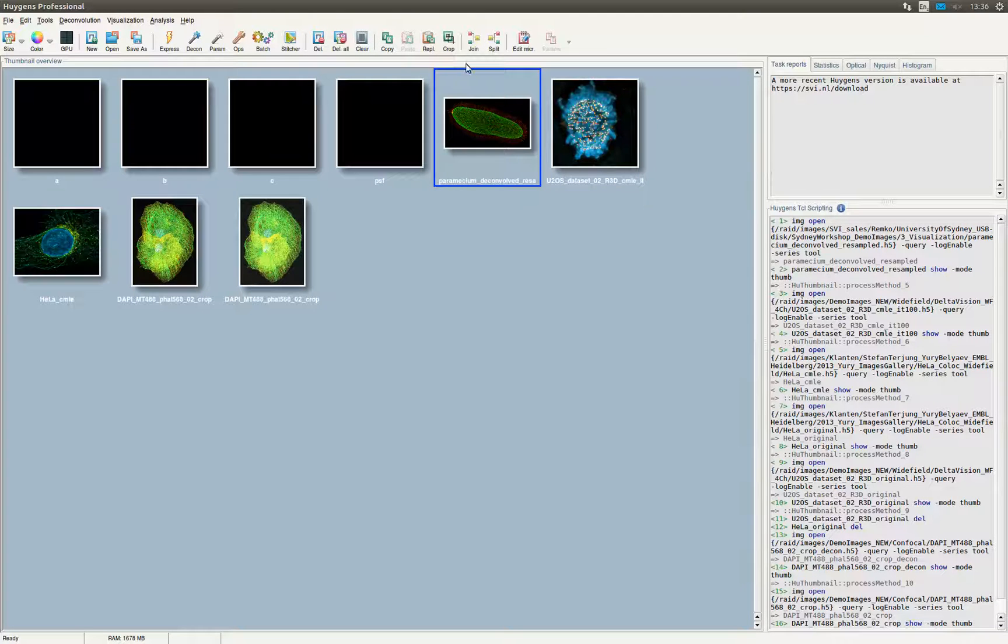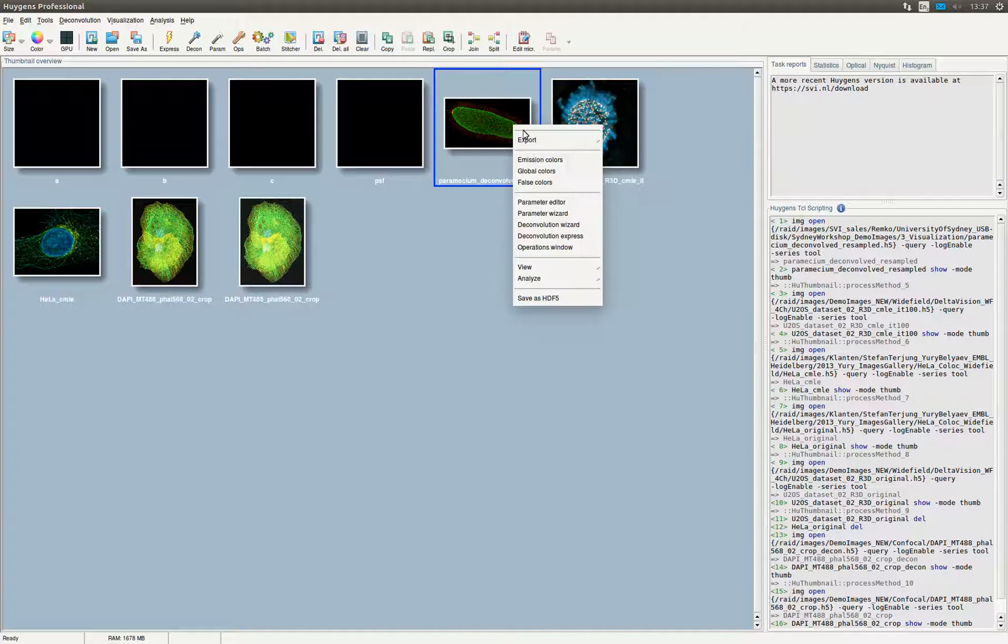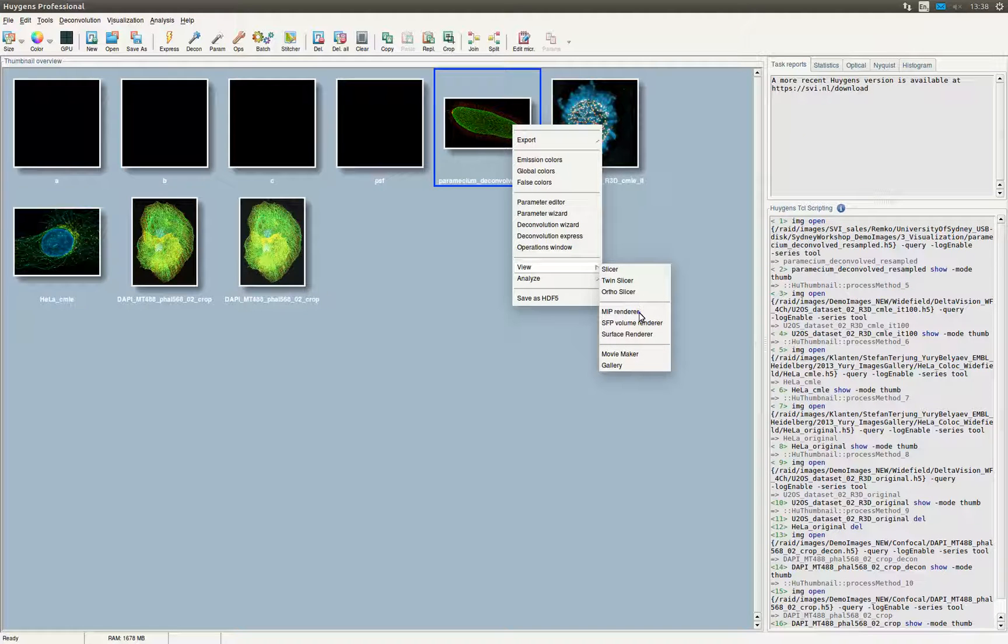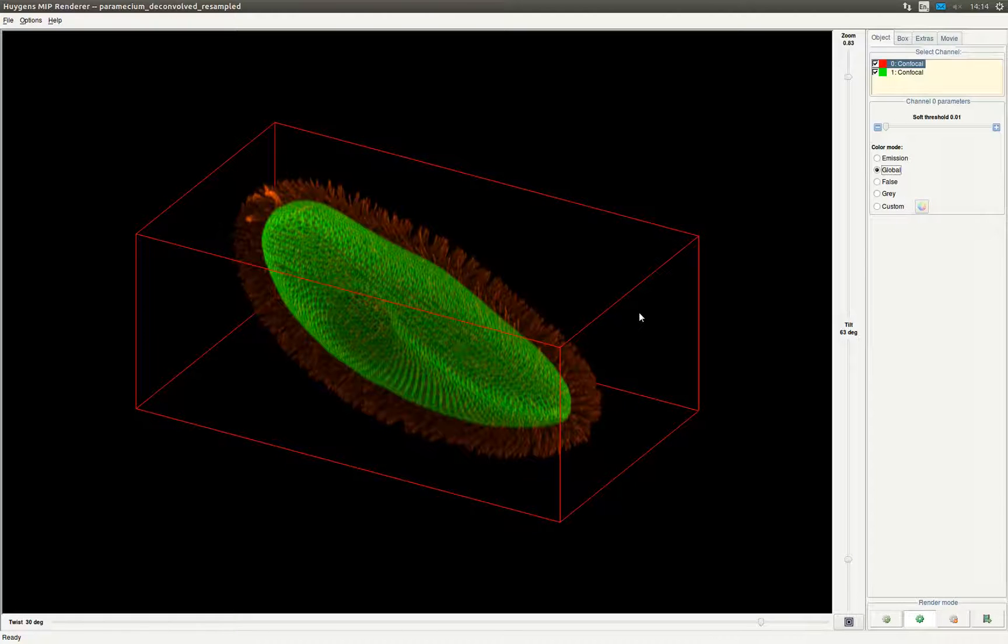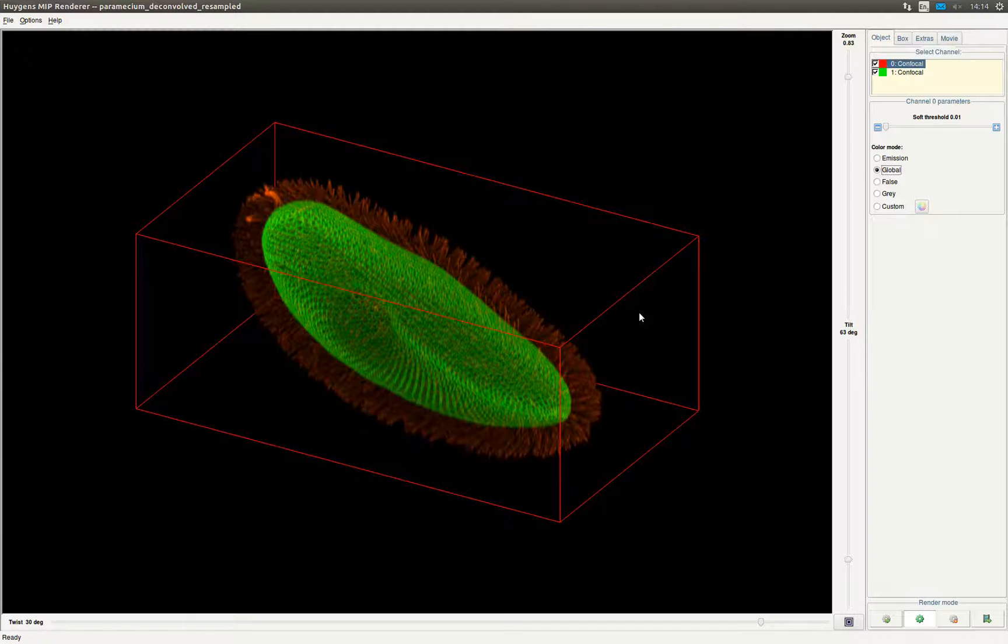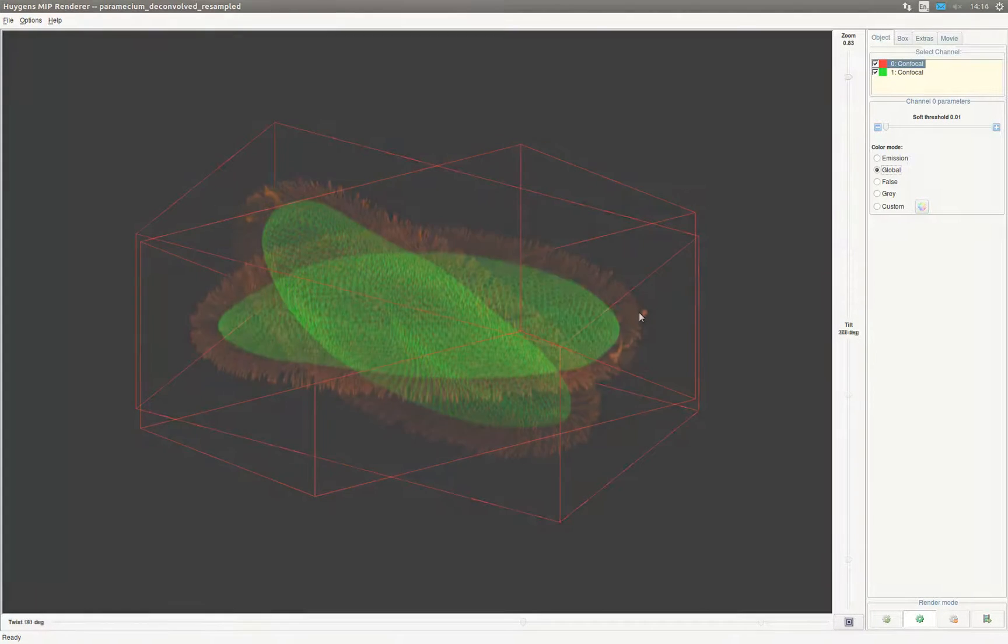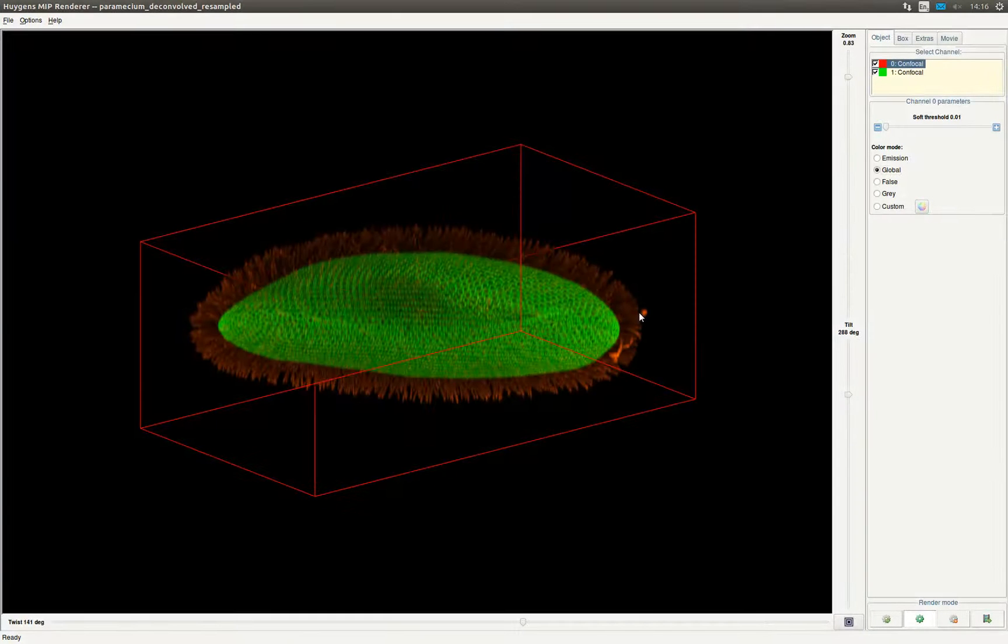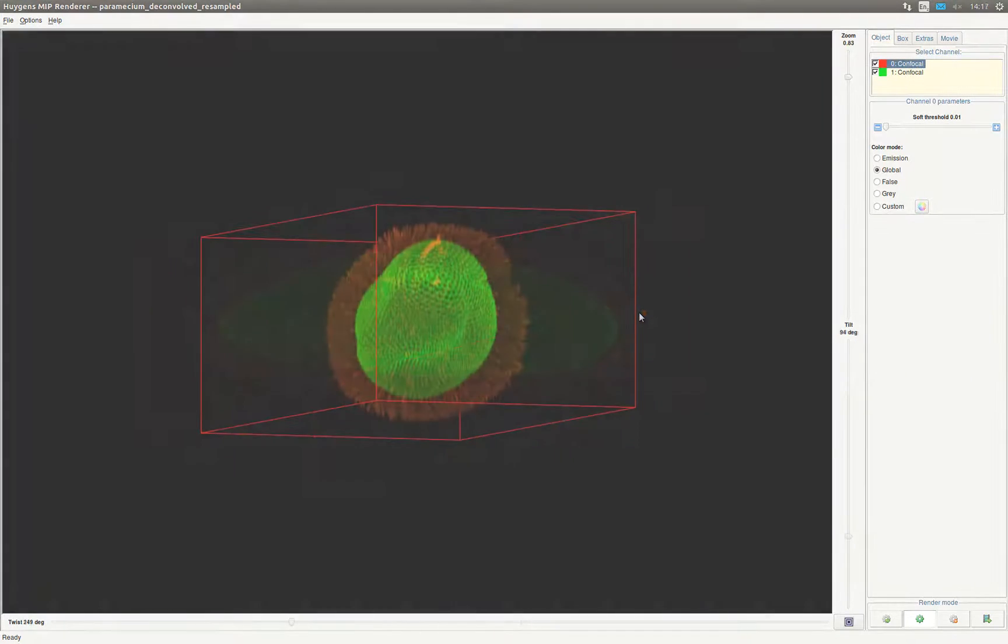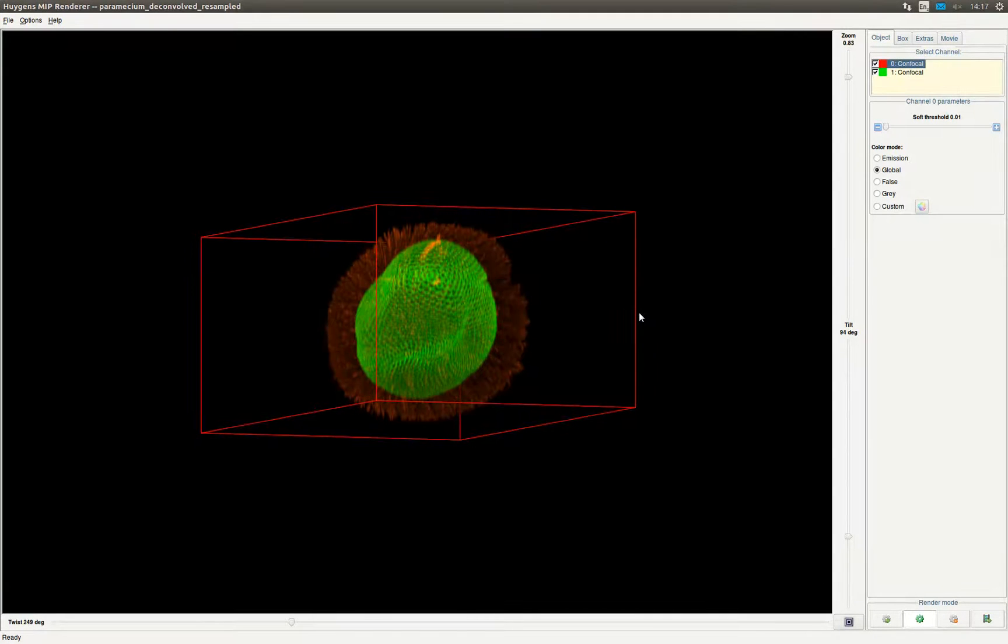Back in the main window we right-click the same image again, go to view, and select the MIP renderer. The maximum intensity projection renderer enables the possibility to obtain an orthogonal projection of 3D data from any given viewpoint. Like in the SFP renderer you can move around the object by dragging the image, or by using the sliders to twist and tilt the object.